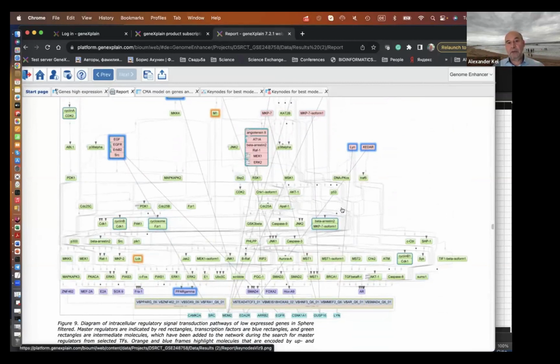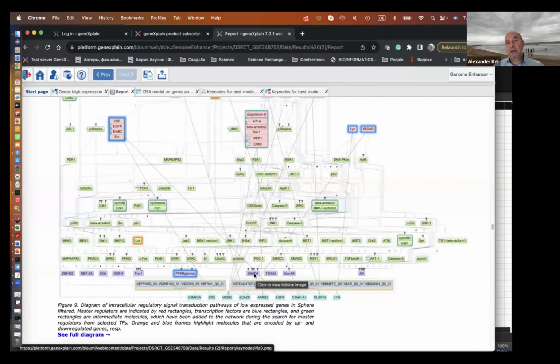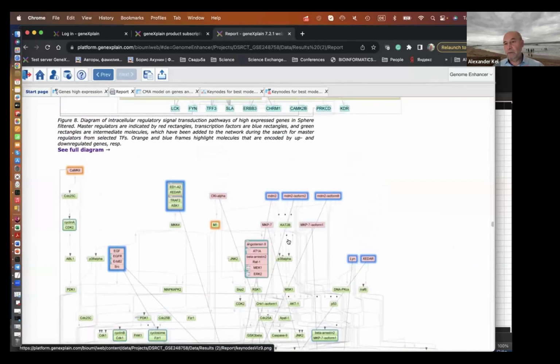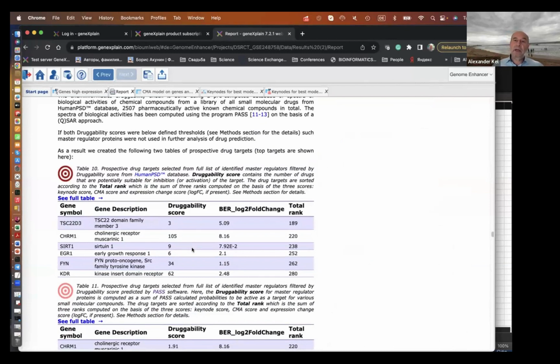The downregulation is controlled by a set of transcription factors, which play a repressor role. To start repressing, they have to be activated, or, well, in most cases it's not active repression, but removal of activation, when you see less of those factors activating your gene. Then the expression of those genes goes down, and you see those master regulators found here for the downregulation.